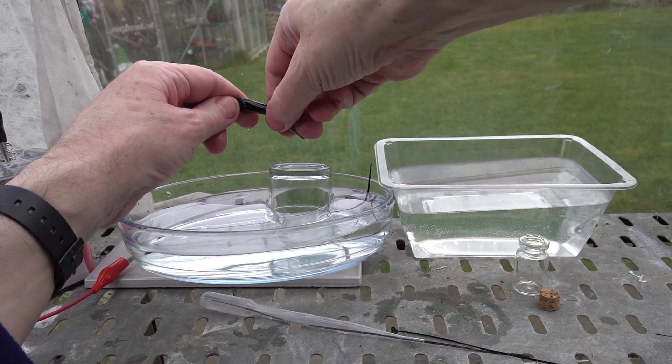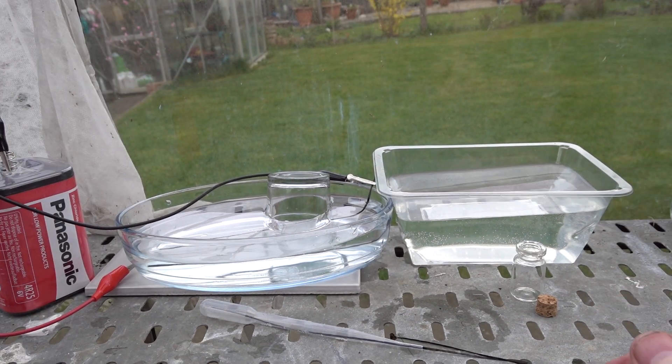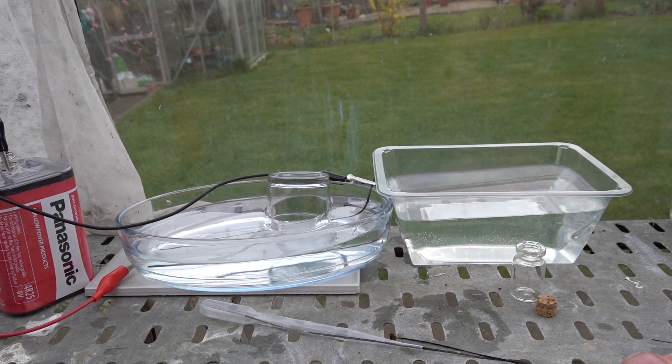So that's a simple electrode for collecting gas in electrolysis experiments.